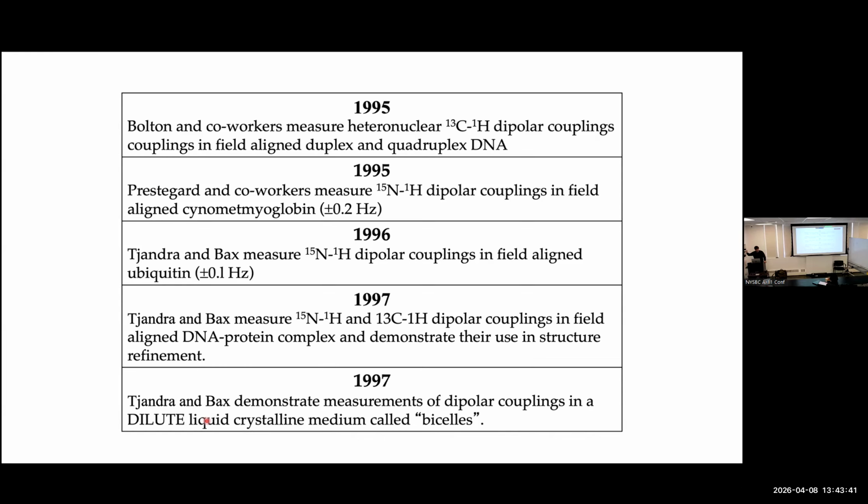So it's important to think about this: you can't just align your sample, you better have a reference, which is the sample where it's not aligned, right? And if you're magnetically aligning the sample, the only way to avoid it being aligned is to have paramagnetic metal versus no paramagnetic metal. Like if I take a paramagnetic metal out of myoglobin and use carbon monoxide myoglobin, which is a diamagnetic form of myoglobin, then I could subtract those two, right, and get the RDC from there.